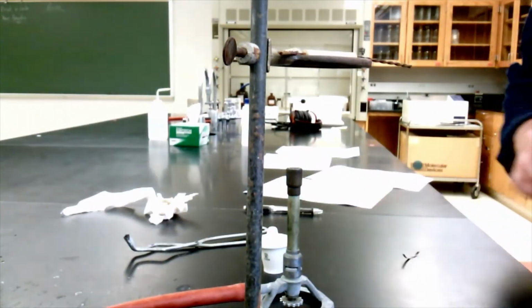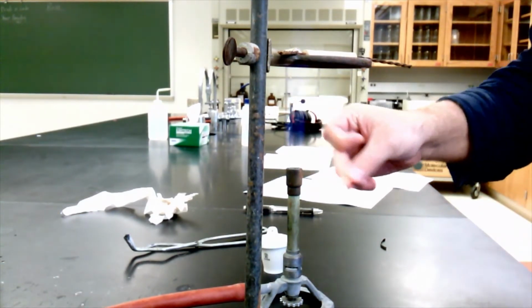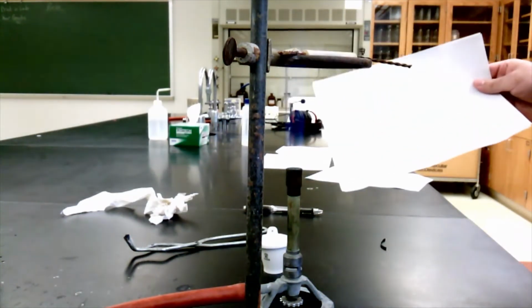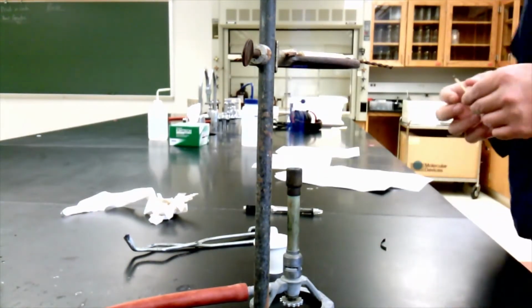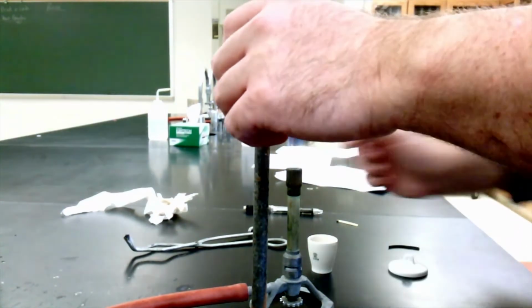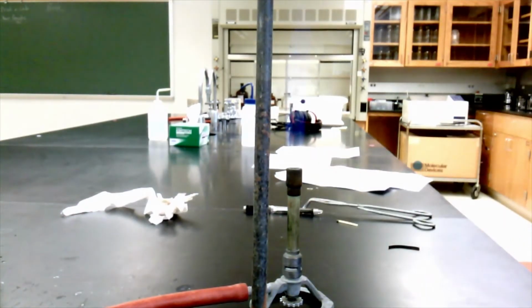Okay, so here's the fun part of the lab that you guys don't get to do, which is lighting the Bunsen burner. Playing with fire in general is always kind of fun. You guys can't maybe see this real well. Well, you can kind of see a little bit there. Okay, my Bunsen burner's on. Got a nice big flame going. And now I'm just going to heat my crucible until it's nice and super hot and all of the water is gone.